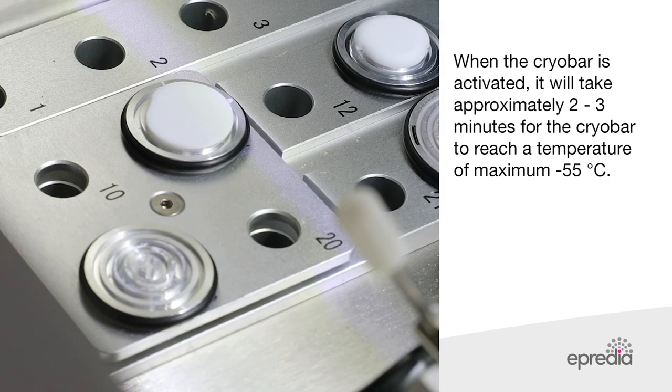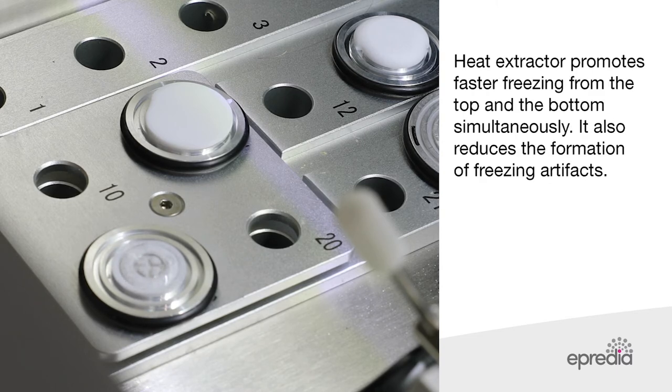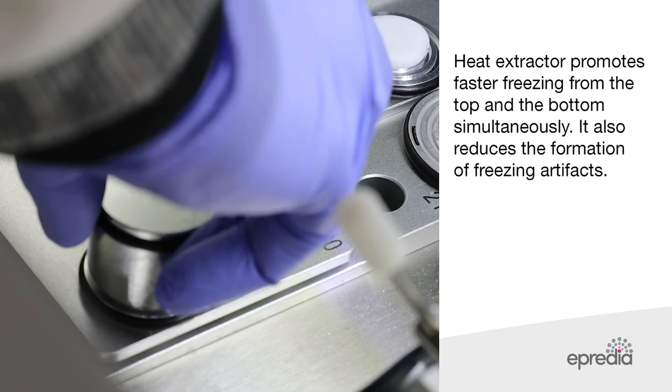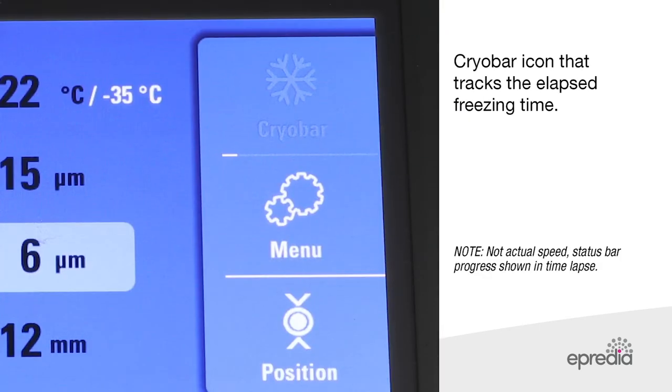When the cryo bar is activated, it will take approximately two to three minutes for the cryo bar to reach a temperature maximum of minus 55 degrees Celsius. Use of a heat extractor promotes a faster freezing method, which freezes from the top and the bottom simultaneously, and also reduces the formation of freezing artefacts. The cryo bar icon tracks the elapsed freezing times.